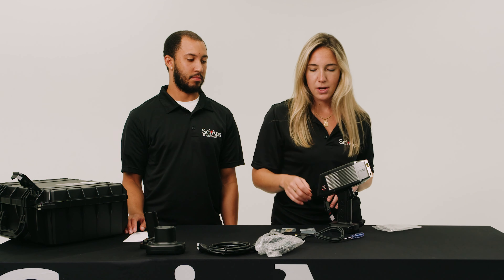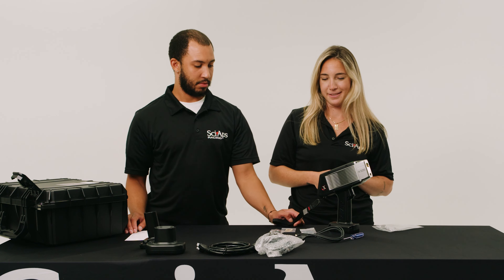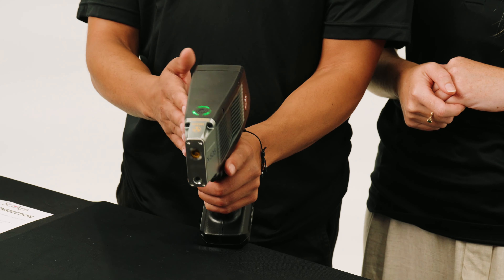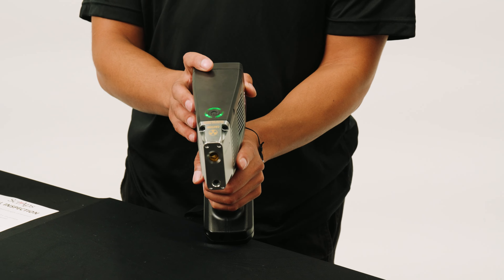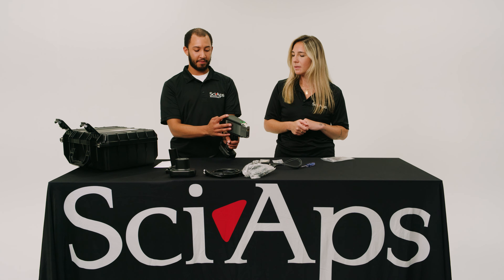We're going to give it a couple minutes to turn on and show you some fun things that it does. Once the unit turns on you'll be at the enter username screen — the username will be admin. The generic password for all our units is 12345.